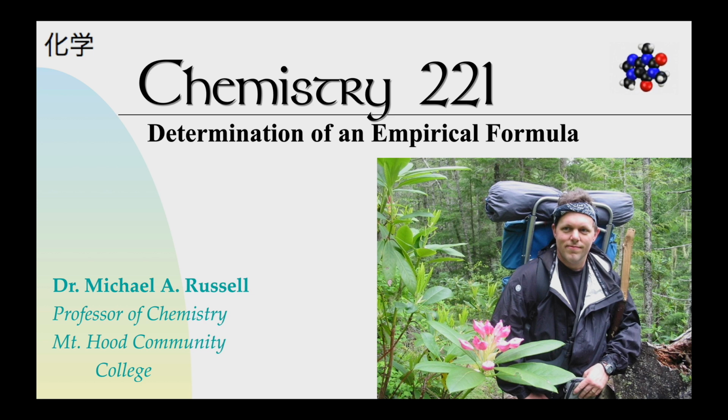This lab will provide experience with how to not only go from grams to moles, which is a big part of it, but how you can use those moles to find first the empirical formula, which is the smallest whole number ratio of atoms. And from there, you can also go on to the molecular formula, which is usually the desired thing, but the empirical formula is an important first step as you go through this. So without further ado, let's get into the lab.